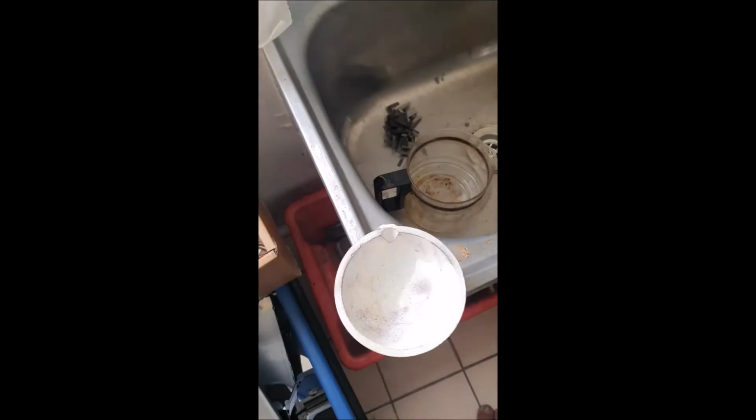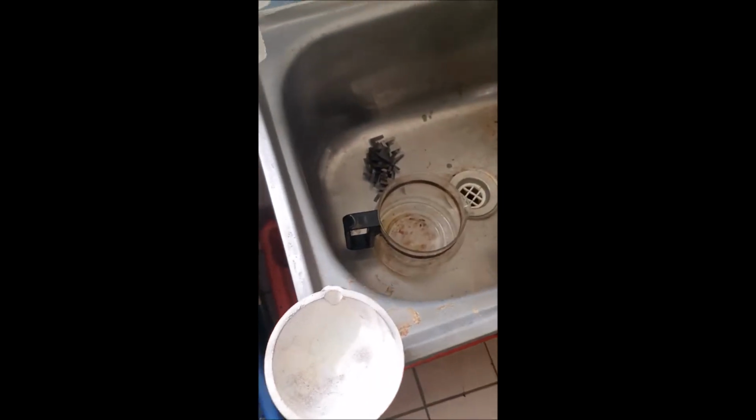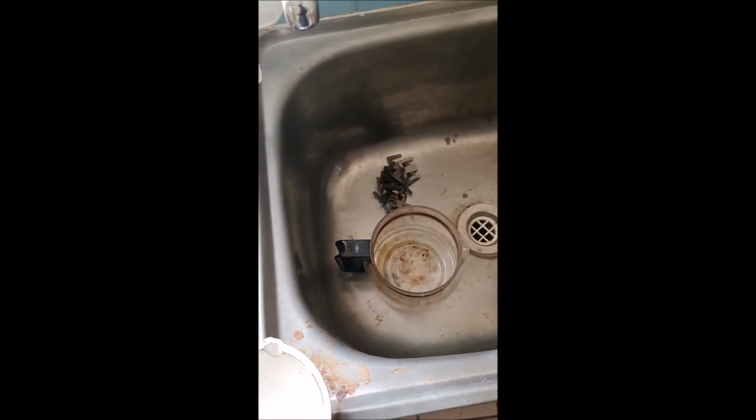I've got a different nozzle for this. I might swap it over, and that'll let me get a lot more heat a lot quicker. Alright, so I'll just swap the head over. Okay, so I've tipped them into the sink for now, because I'm just going to give them a little bit of a wash before I actually put them in acid. I'll put some more in here. I won't show the whole lot because you get an idea, we'll just do a few. I've changed the head over so I get a lot more heat.